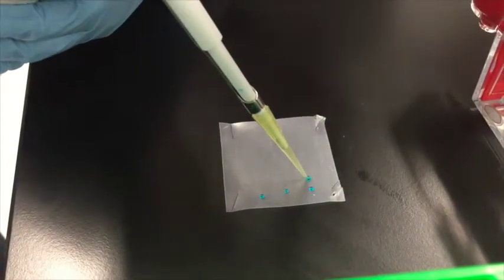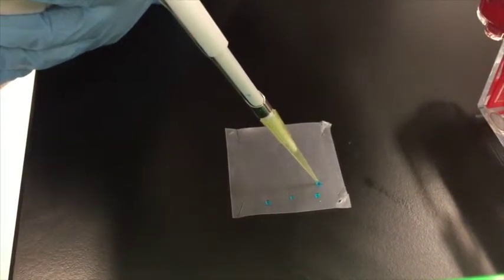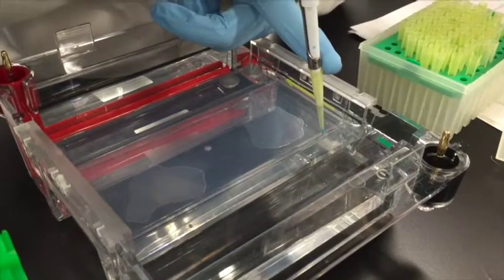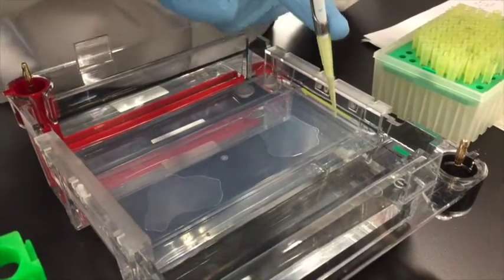As a consequence of this, the samples couldn't be correctly visualized. If it is necessary to increase the voltage, we should consider that the speed of migration of the fragments in the gel will increase proportionally. For the concentration of agarose used in the report, we should have applied a voltage of less than 60 volts.